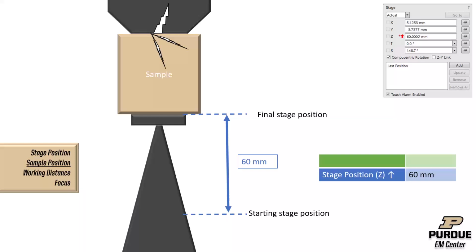and I break things. You can break the pole piece, you can break your sample, and this leads to lots of problems really. You're not happy, we're not happy. We have a broken microscope. Other users aren't happy because now they can't use this microscope until it's repaired. We did have this happen at Purdue University once. We had a student run their sample into the pole piece and they did break it, and this cost us about $30,000 to get that repaired.